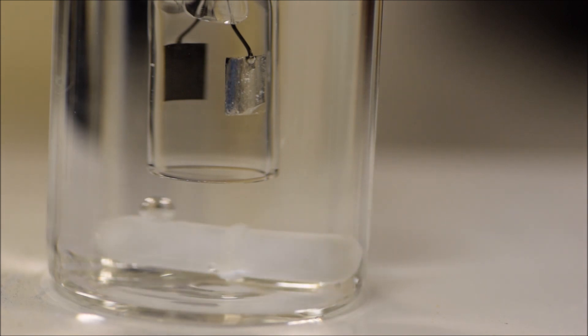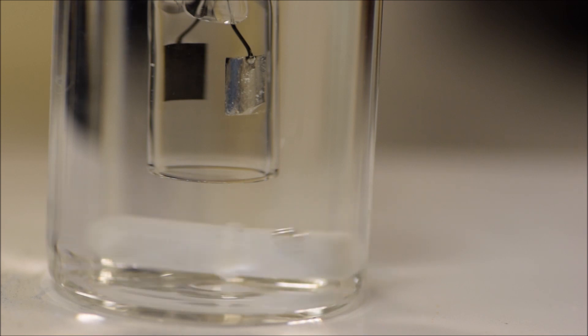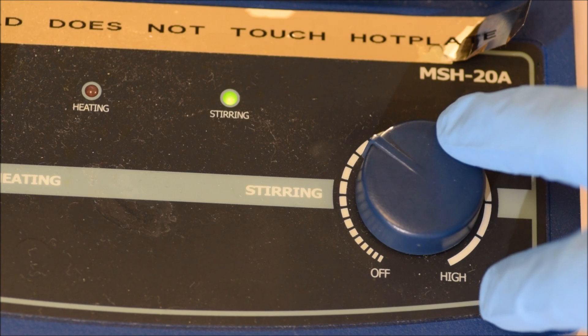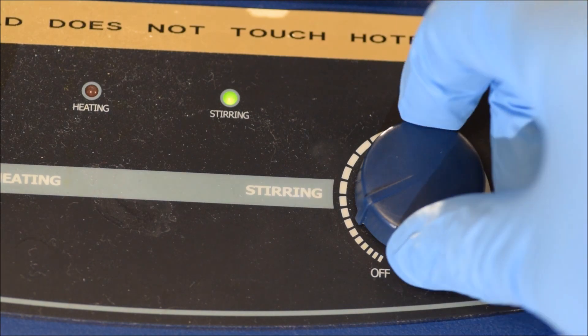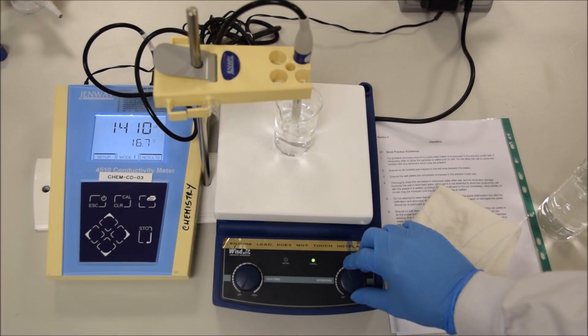There it is spinning underneath — it's not going to cause any harm. But if it's spinning and it's banging off the probe, you won't get a stable reading and you might damage the probe. You can look from the side, edge on — move your head down and look in the side of the flask to make sure that it's set up right; it's almost impossible to tell from the top. Also, don't turn up stirring too fast. If you do, a vortex forms in the water and it's going to pull air inside the conductivity probe, giving you readings that aren't accurate. And don't forget to turn it off when you're done, because you can't tell it's running unless there's a magnet on it, and if you bring a magnet to it while it's already running, your solution will splash.